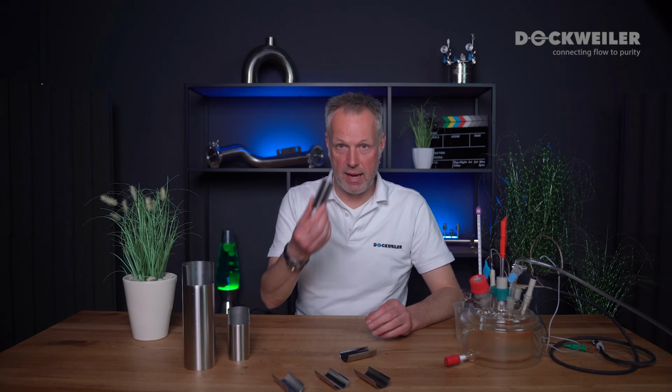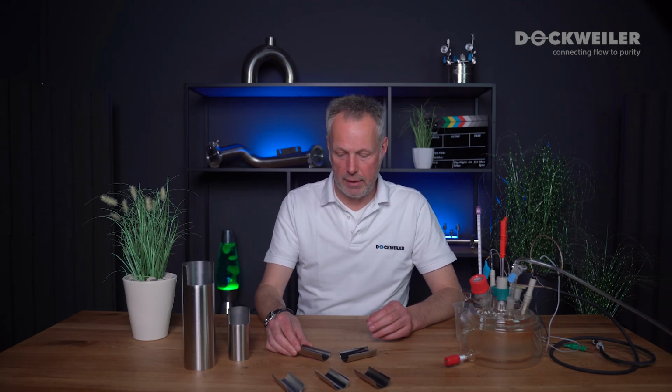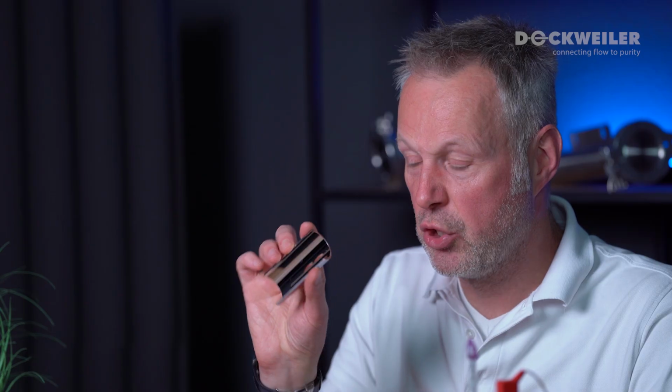And what we achieved when we did that was that we have an untreated material, such as that here, which is then measured against a slight electropolishing that we have here and the final electropolishing, which you see here. So for all these three, we prepared specimens that we introduced into our apparatus here.